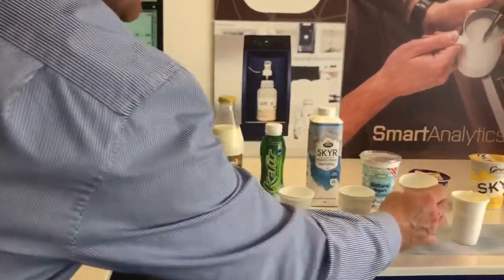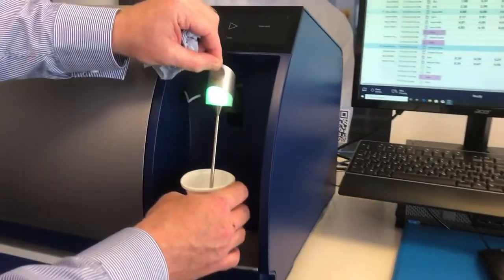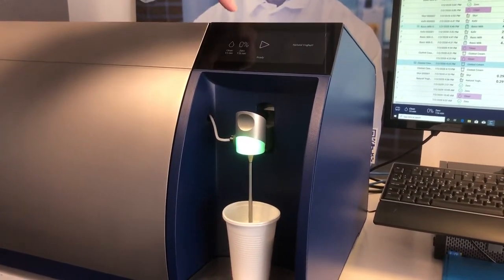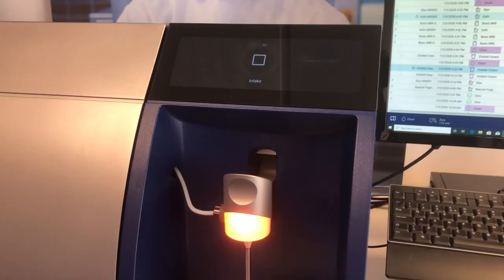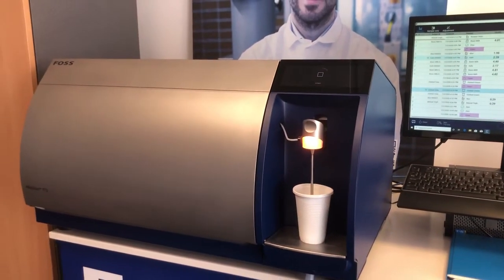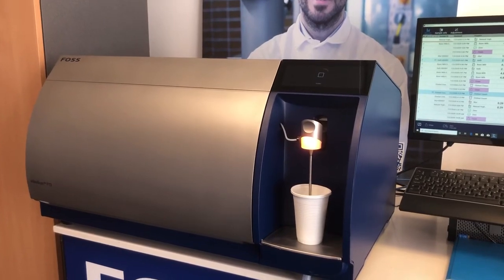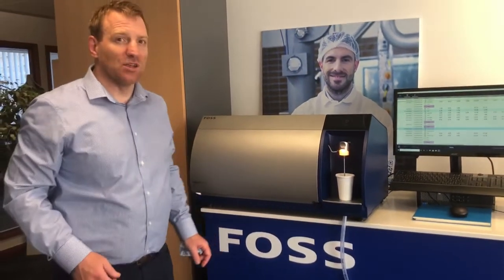We'll then move on to take our next sample — something slightly thicker, a natural yoghurt. Again, everything is done on the new touch screen and there we have the next sample running. There is our brand new FT3. If you'd like some more information, please contact us.